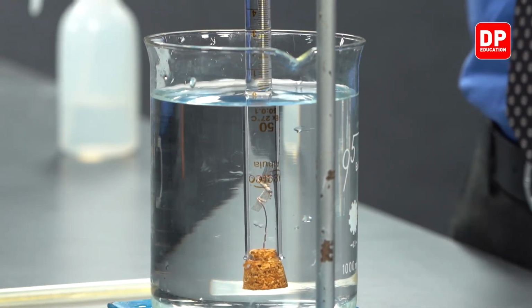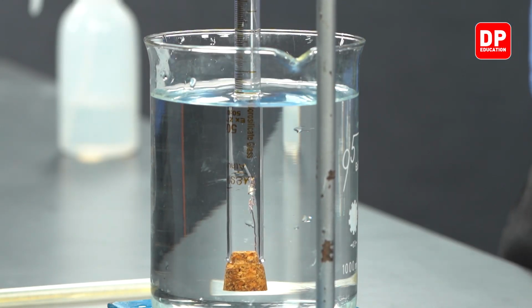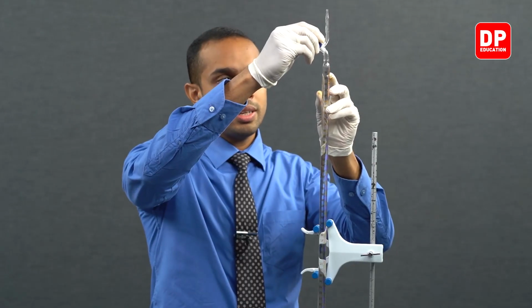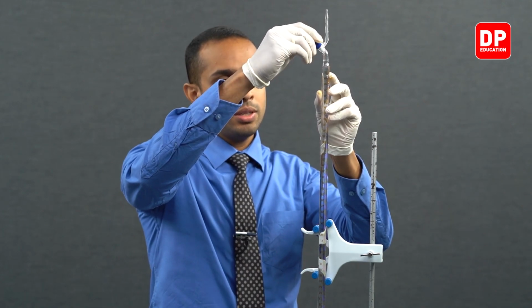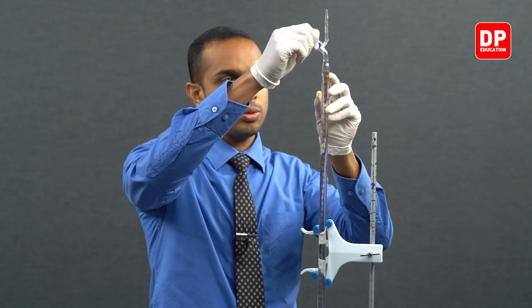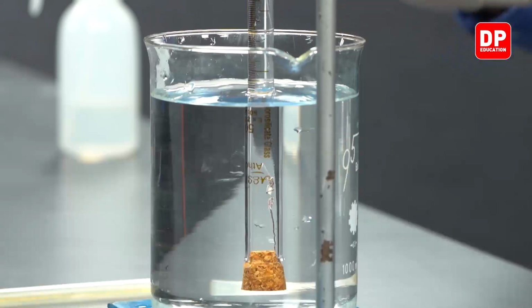After placing it in, before the reaction starts, we have to make sure that the water level is at the 50 milliliter line. So we have to bring this water level to our 50 milliliter line by opening the tap. Right. Now you can see the reaction has not yet started.